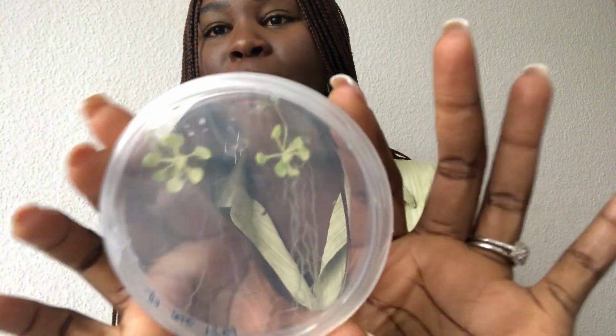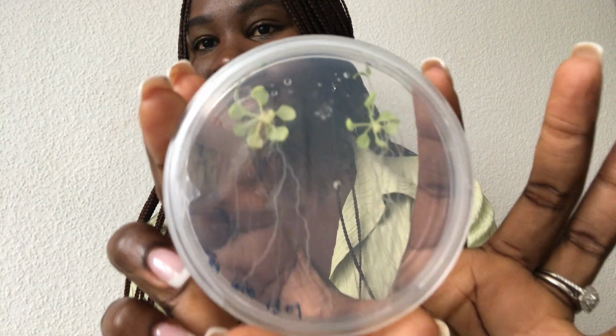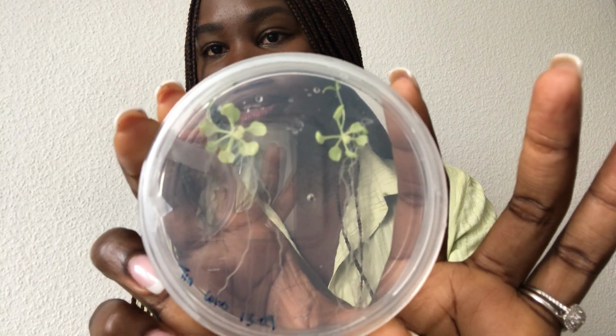But you can see, for example, this is a very, very sterile petri dish, right? So the question then is, why do we work under sterile conditions? So I could start by saying that the plant in itself is not so highly evolved that it will have very unique immune responses that are for bacteria alone, for nematode alone, and for fungi alone, for example, right?